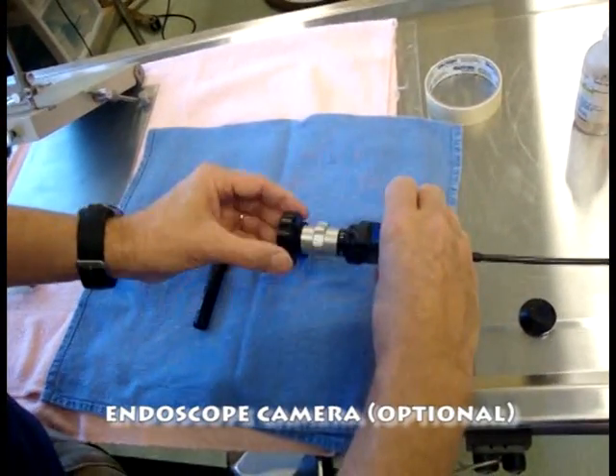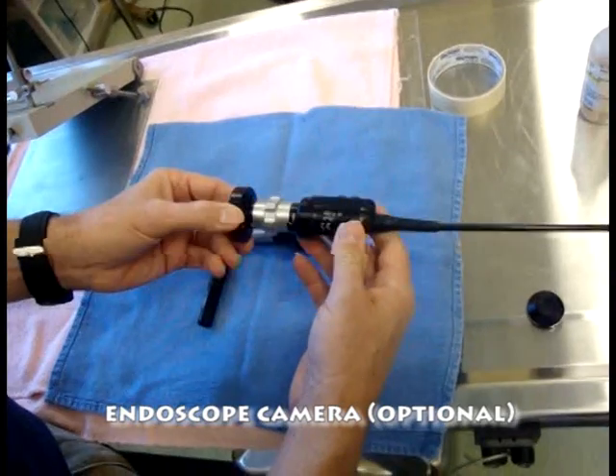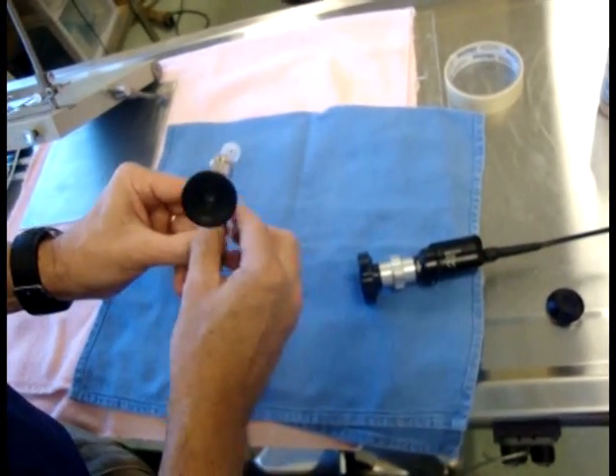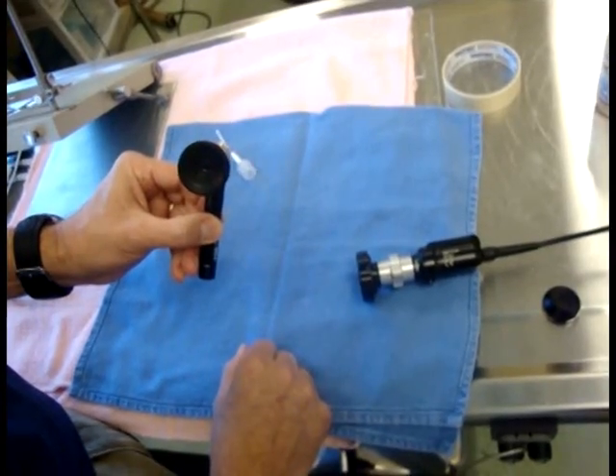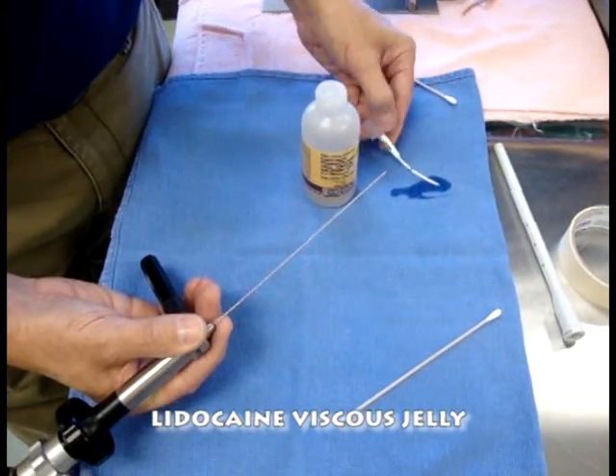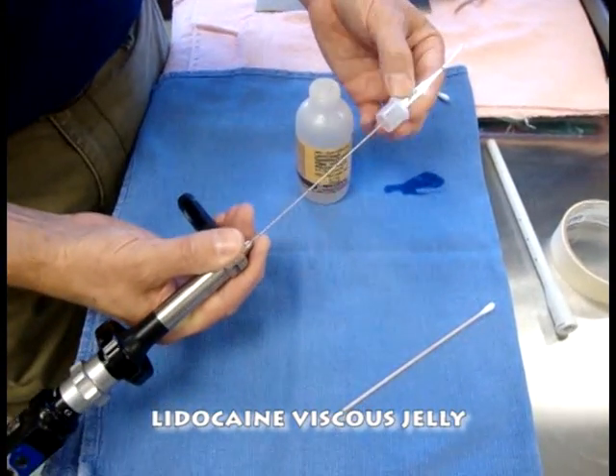To document the intubation I will be using a Carl Storz camera, but typically I would do this just looking through the eyepiece myself. I'm going to lubricate the end of the tube with some lidocaine viscous jelly.